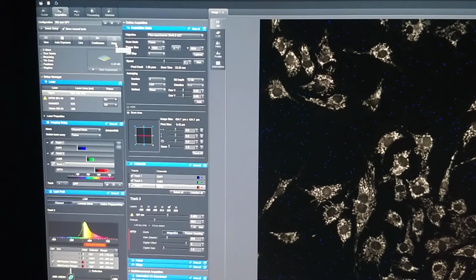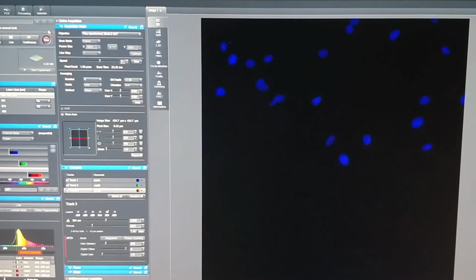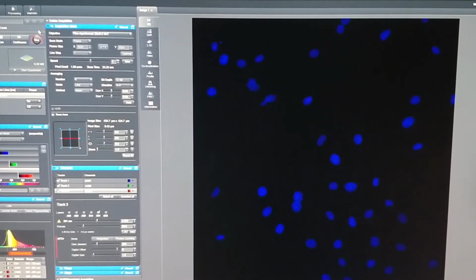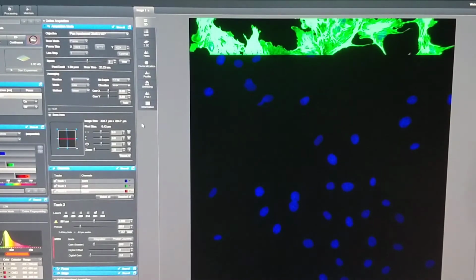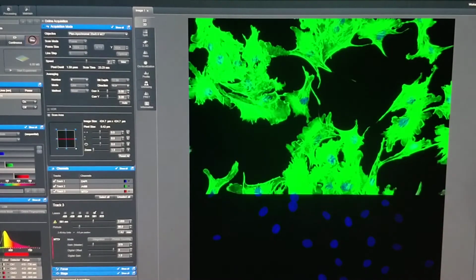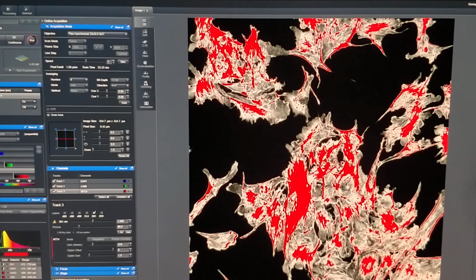Okay. When we click on snap, you're going to see that the image quality, this is the actual final picture. Live is really a preview, it's imaging at the fastest speed, lowest resolution possible, so it's not very good. When we are snapping the picture, it's actually best. The problem though, you can see is that the green is way too saturated.